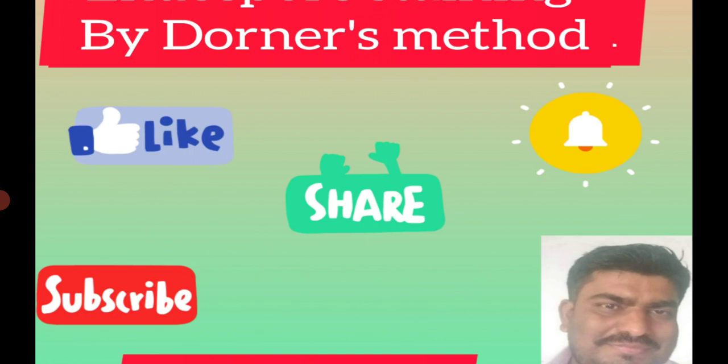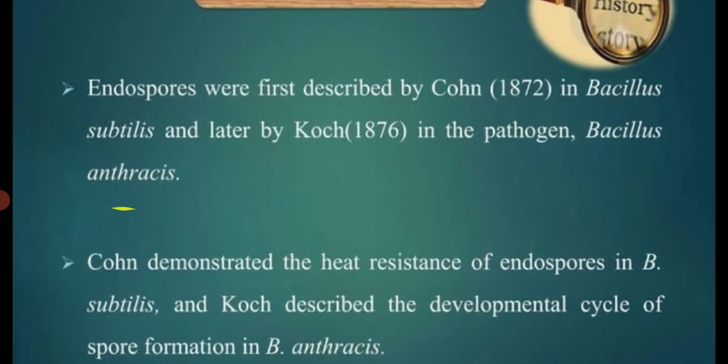So let's start with the history of endospore. Endospores were first described by the scientist Cohn in 1872 in the organism Bacillus subtilis, and later by the scientist Koch in 1876 in the pathogen Bacillus anthracis. Cohn demonstrated the heat resistance of the endospore in Bacillus subtilis, and Koch described the developmental cycle of spore formation in Bacillus anthracis.